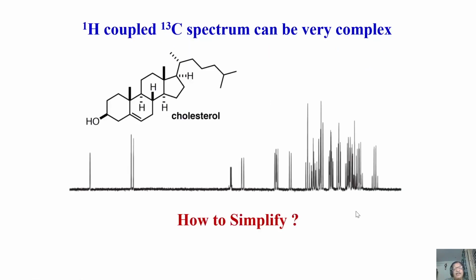So this is the type of information we get for the different chemical shifts of carbon. In a realistic example, we get a spectrum like this. It's a big molecule. This is a carbon-13 spectrum. Now your job is to analyze. First you have to simplify the spectrum to identify the number of carbons. Remember, it is a carbon spectrum. You have to assign peaks to each carbon. How do you do that? This is a procedure by itself. Now we have to start analyzing the carbon-13 spectrum.